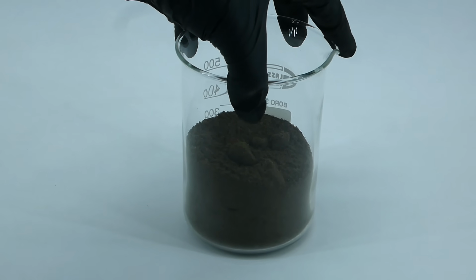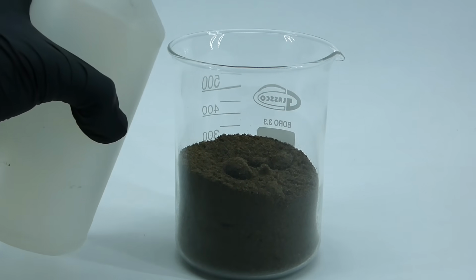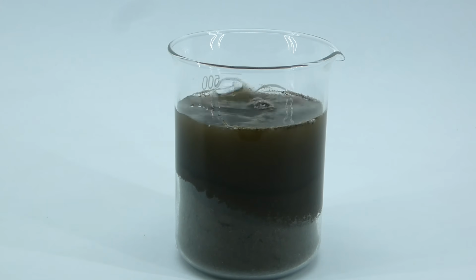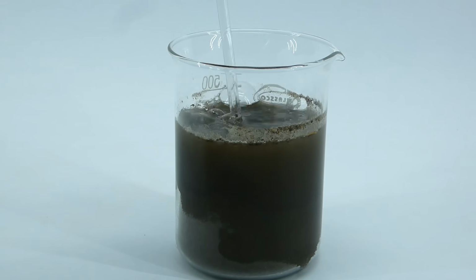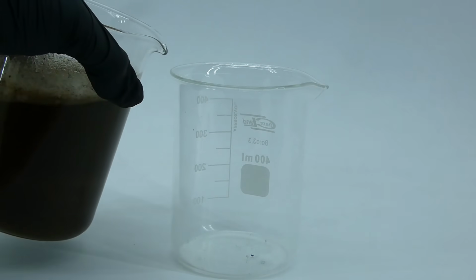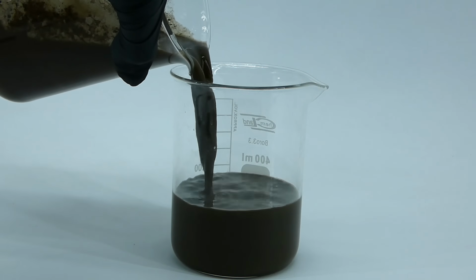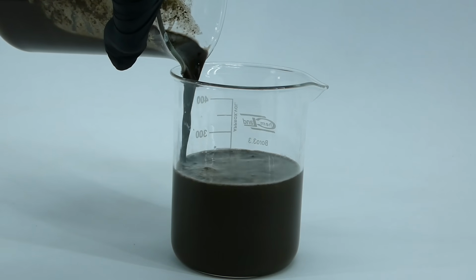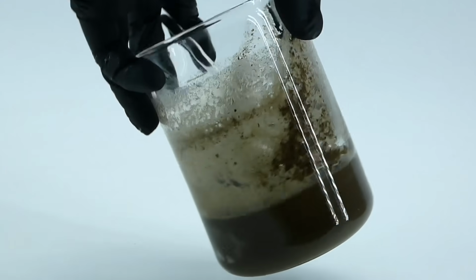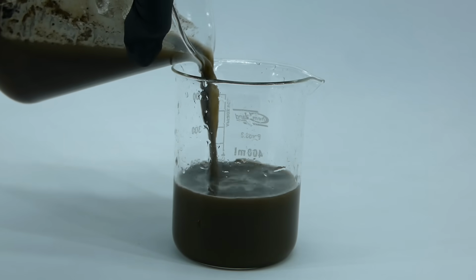The first step in extracting pure silicon dioxide from dirt is to wash it several times with water to remove most of the water-soluble junk. To do that, I just poured a generous amount of water onto my dirt, stirred it, allowed the sand to settle down, and decanted the water off. I did a total of 4 washings, and after the last one, the sand looked a bit brighter.